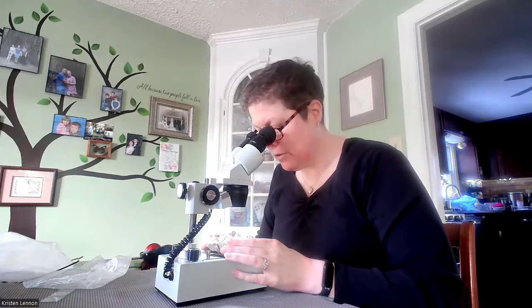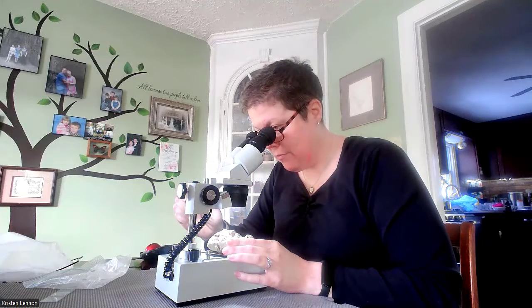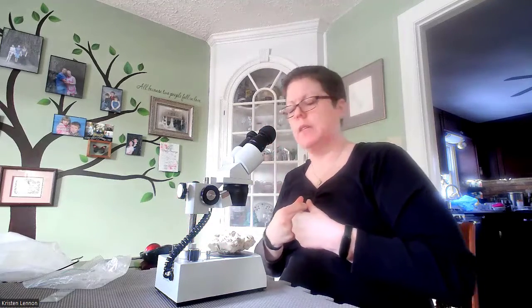If we have something very, very small on a microscope slide, we would probably want to use a compound light microscope, which gives us a little bit more power. But for something like this, you can look through. It's at 2x, so 2 times 10 is 20. And we can focus in on our fossil, various levels of it. So that's why we would use that sort of attachment.